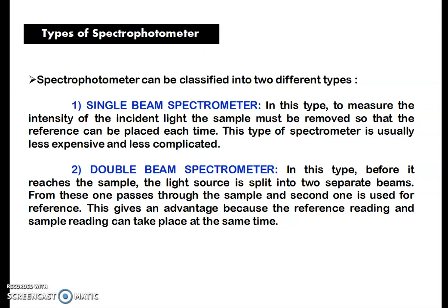This gives an advantage because the reference reading and sample reading can take place at the same time with the same beam, which is divided into two separate beams.